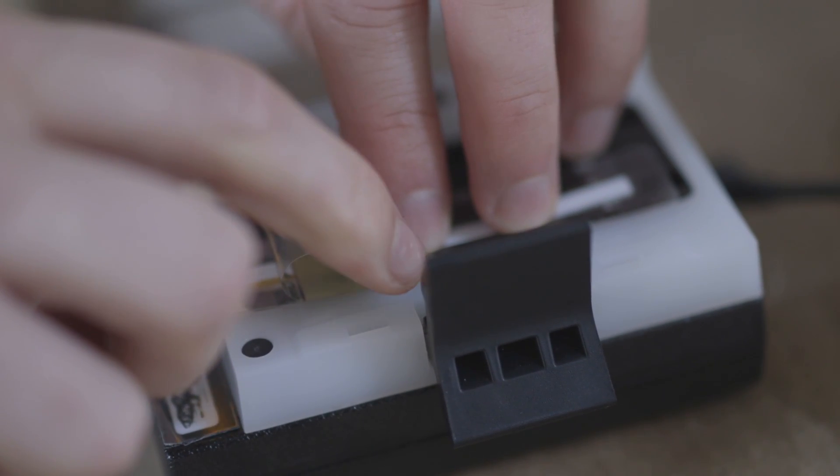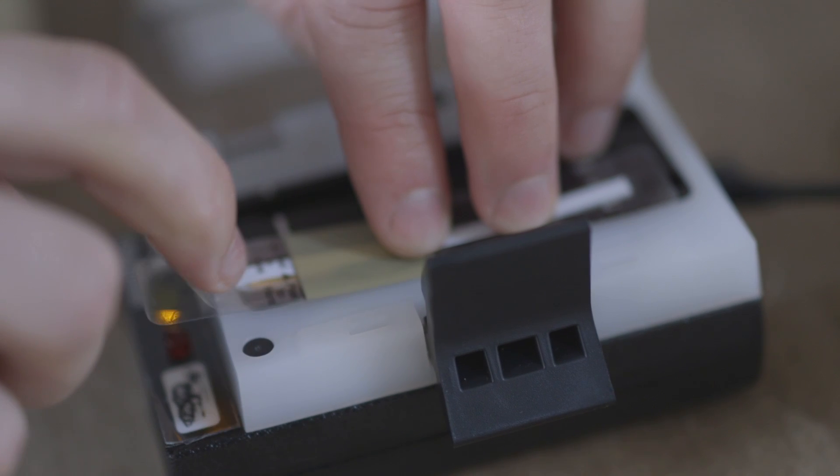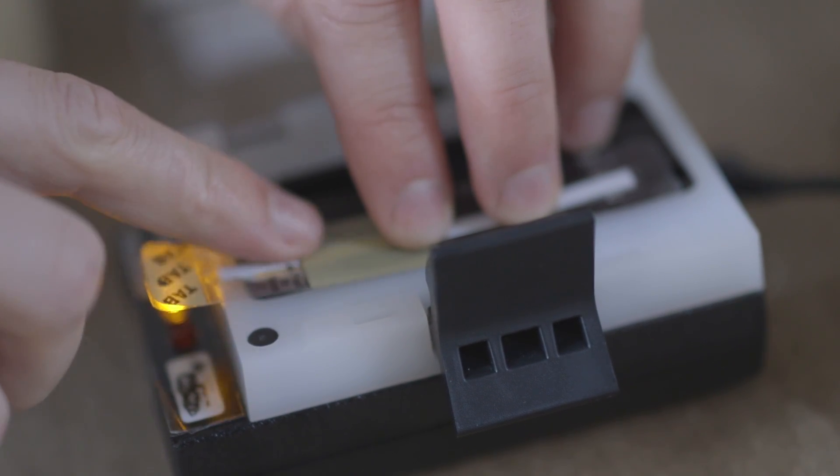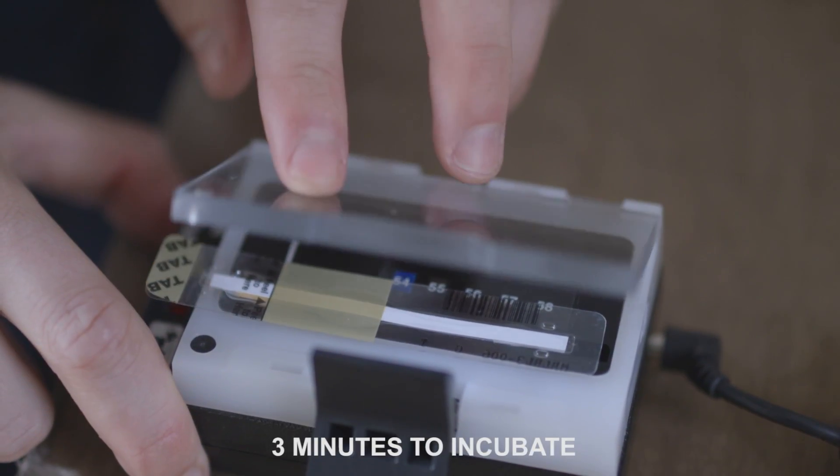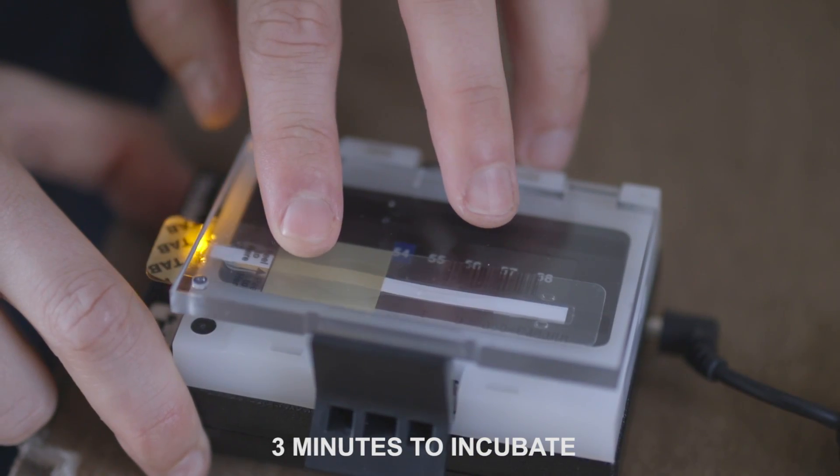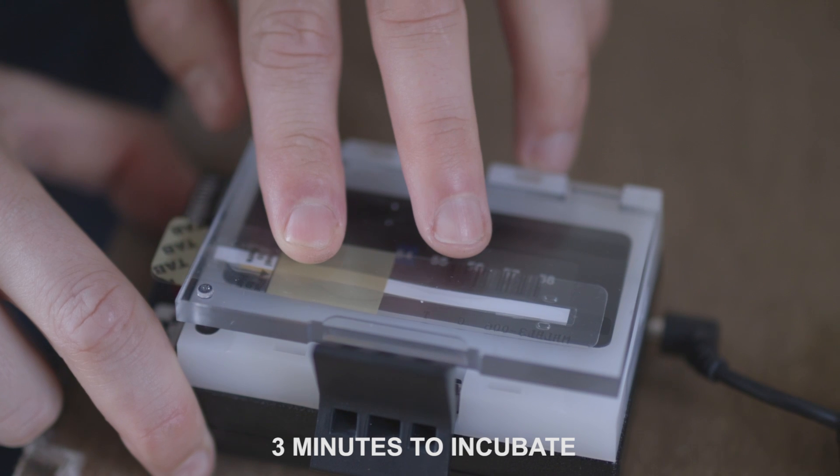Once this is done, we then seal our Charm Strip. Once we seal the strip, the Charm takes three minutes to incubate.